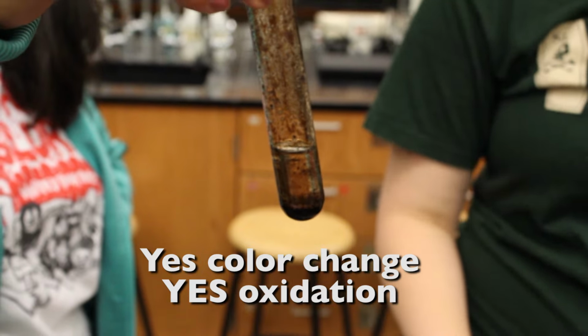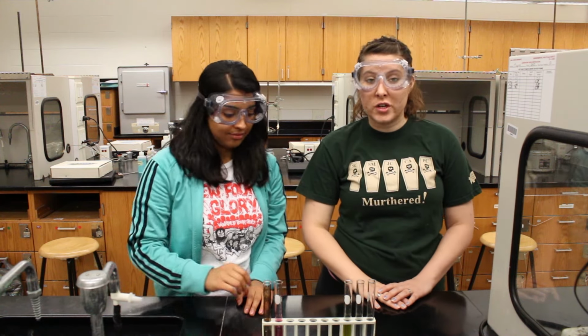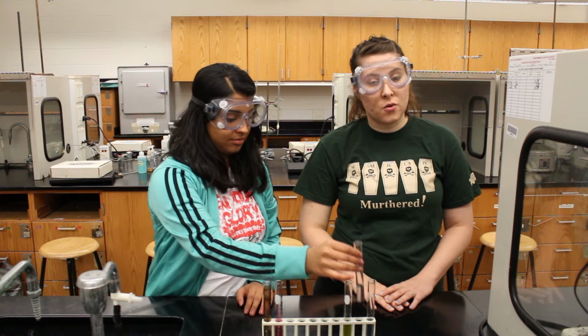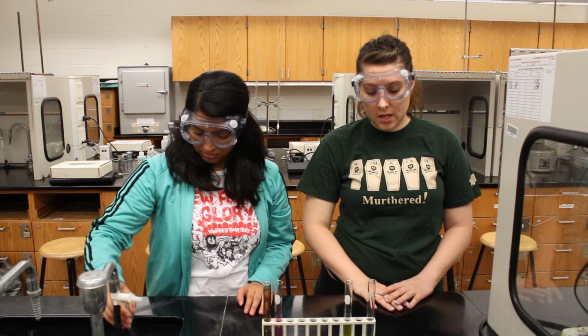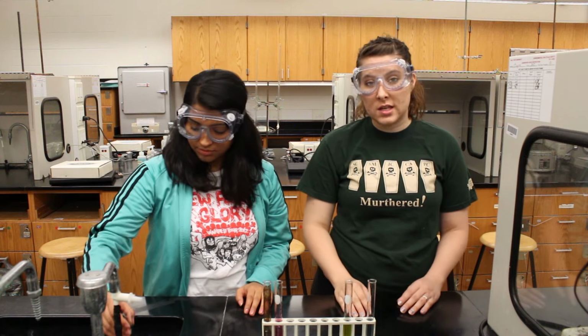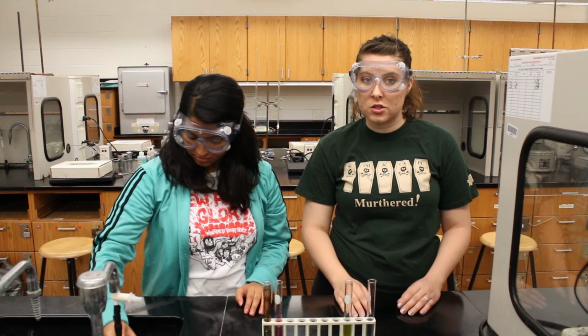Not a pretty sight. When using the potassium chromate, you'll have to add sulfuric acid, so be very careful. If you get any on your hands, be sure to wash your hands immediately. Now, you'll know if the solution's undergone oxidation because the yellow color of the chromate ion will change.